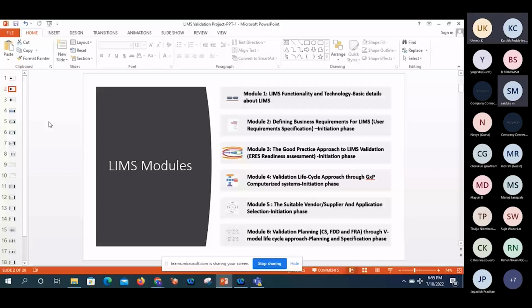I'm not getting validation, you have that license. So based on that, we are going to learn. License? No, we don't have a license. License is different, actually. See, the application vendor should not provide it to anybody. Irrespective of the industry there is Biocon, some companies like Pfizer. Yes, these companies can purchase the system from the vendor. It would cost some crores of money. It's not lakhs also.